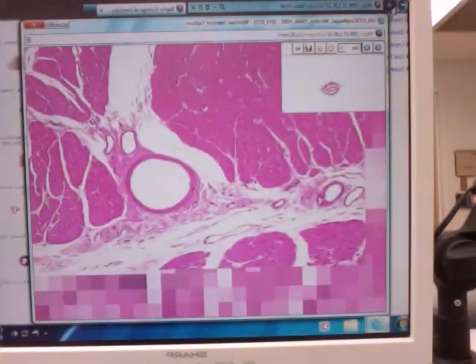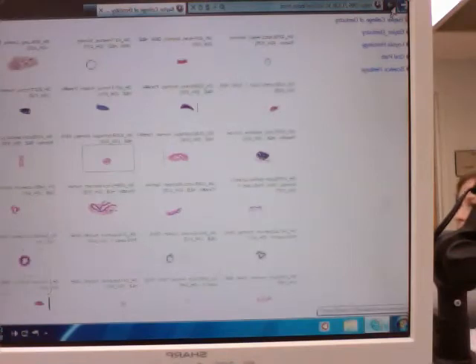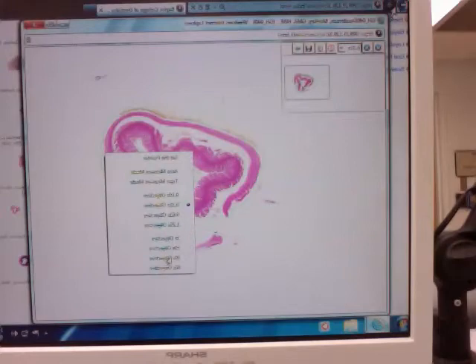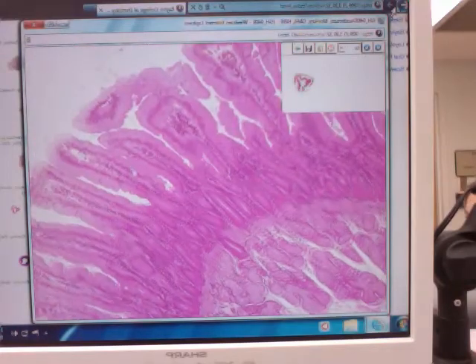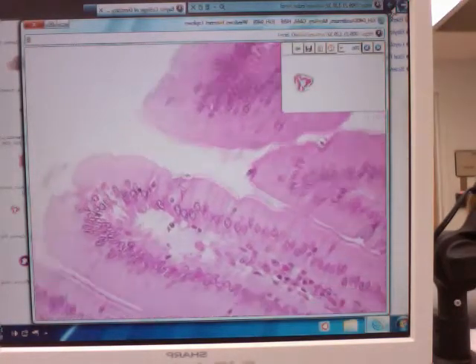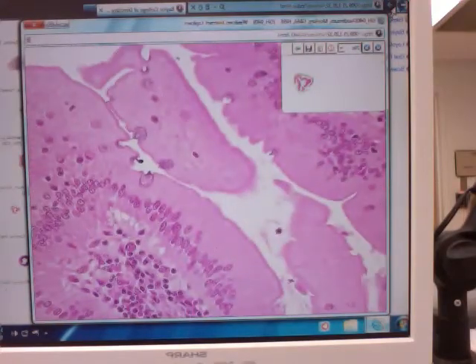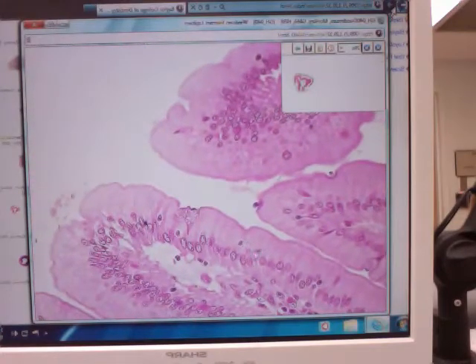Let's see if I can find something. Again, same sort of thing. Oops, let's go a little bit back. Maybe we would blow up a place like this. I could scan around for a while, but I don't want to.